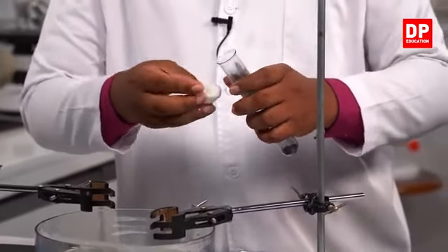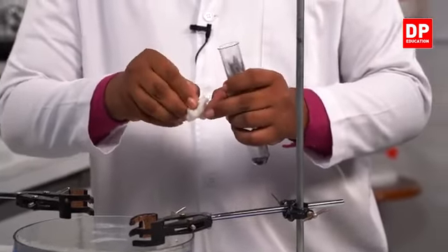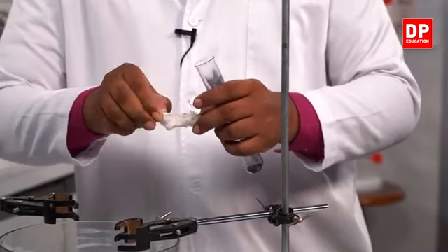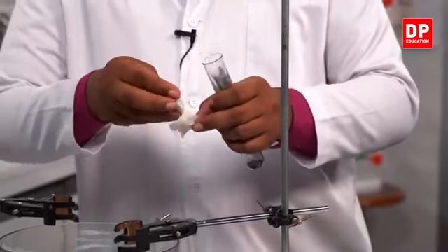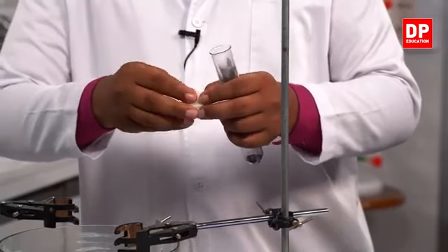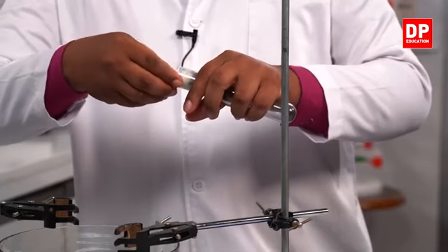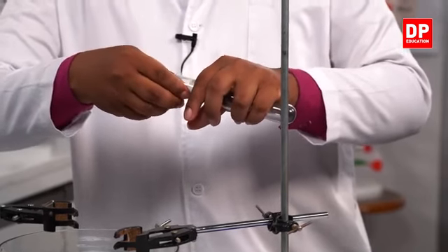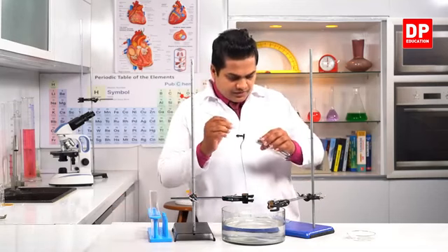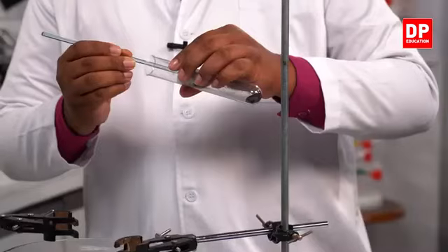Now let's insert this. I'll use a glass rod to insert this firmly into the boiling tube.